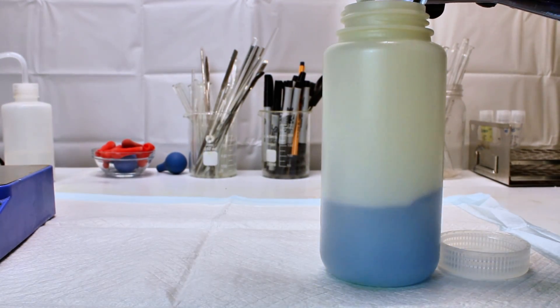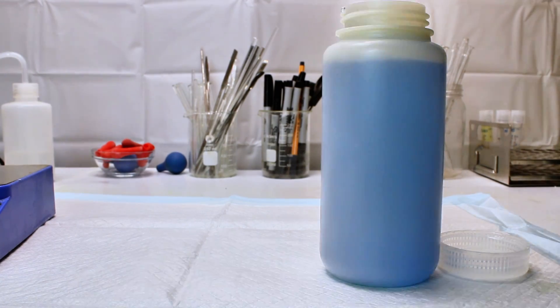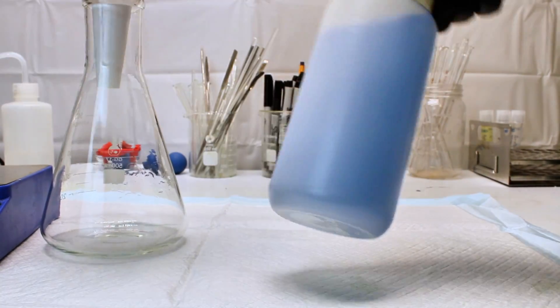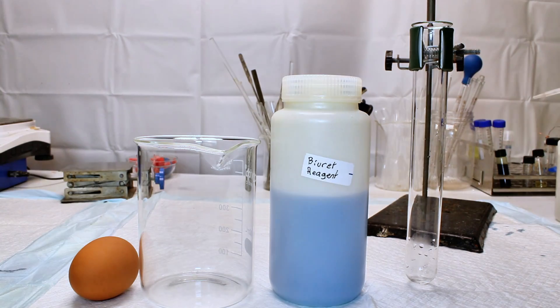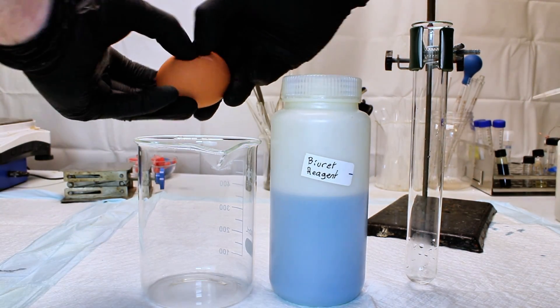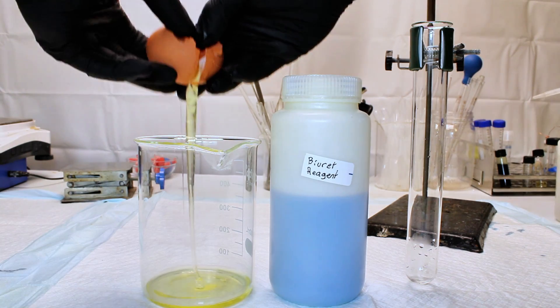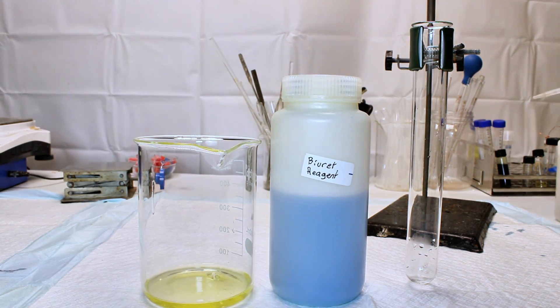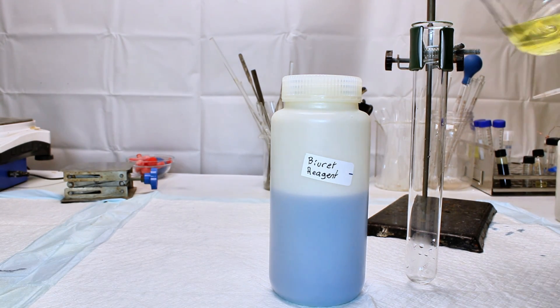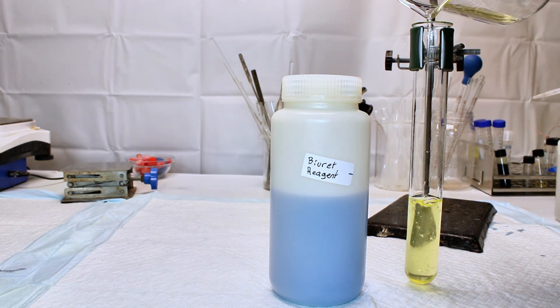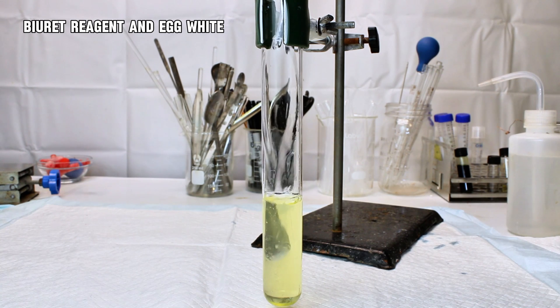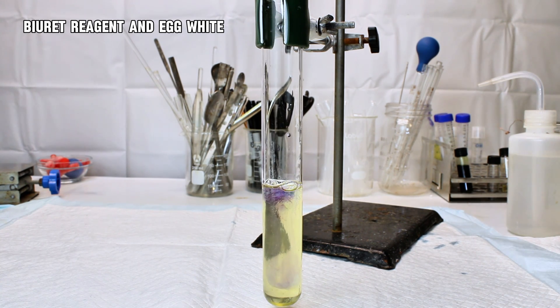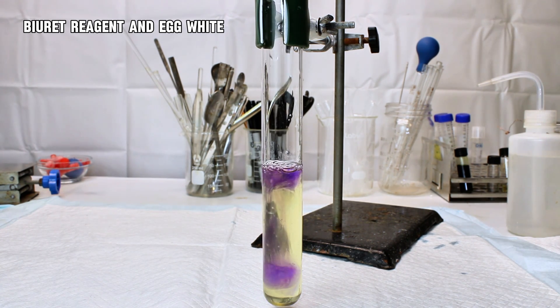Once this is mixed for a minute, it's ready to use, and to make sure it works, I decided to test it on some egg white. I did this first with straight egg white, and then again with 1 milliliter of egg white dissolved in 200 milliliters of water to see if it could still detect protein at such a low concentration. In both cases, the addition of the Biuret reagent to the protein sample resulted in a gorgeous violet color, which was actually quite difficult to see on camera in the dilute sample.